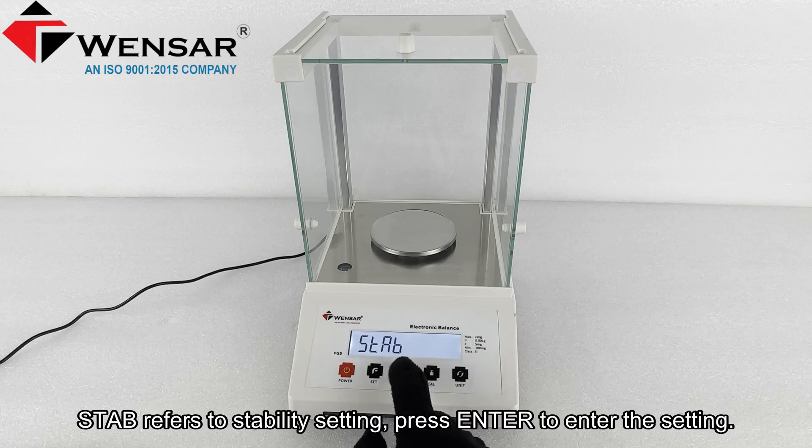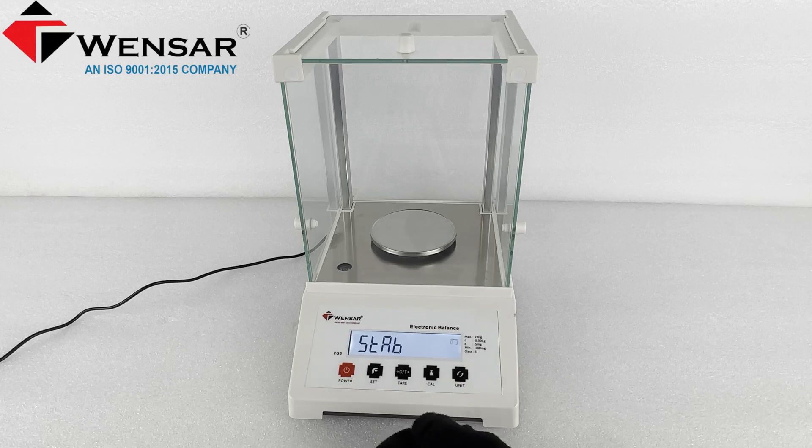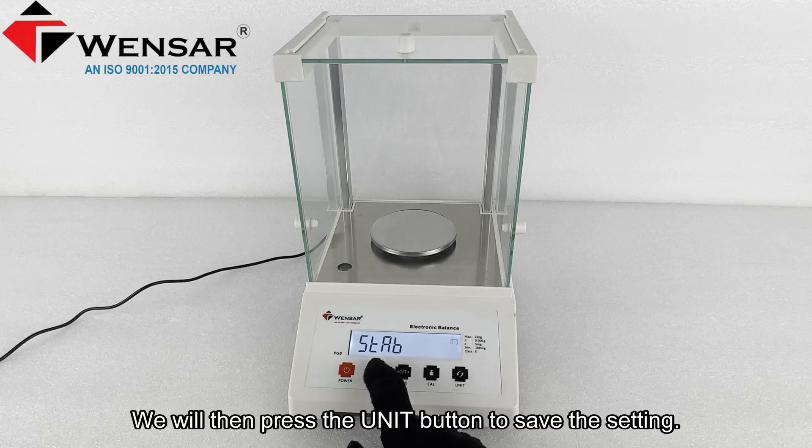Stab refers to the stability setting. Press enter to access the setting, then modify the stability setting using the unit button. We will then press the unit button to save the setting.